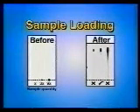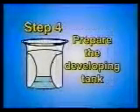One way around this is to make 3 separate spottings on the baseline, the first with only a small amount of solution, the second with about 3 times as much, and the third with 3 times as much again. In this way, you are likely to get at least 1 spotting with the correct amount of material. Remember, the TLC is an extremely sensitive procedure, and it is very easy to overload the plates.